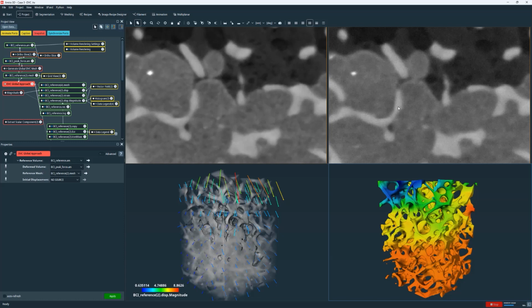So now let's look at the structure. The dark gray structure is the cement, and the light gray structure corresponds to the trabecula, and then the dark area corresponds to the air or soft tissue. Then there is a volume rendering of the bone cement, which shows the displacement vector from the original acquisition, so before the compression, to the compressed data. And finally, there is also an image of the 3D surface of the axial strain in the bone phase. So let's go to Amira software, and then I can show you more details about this project.